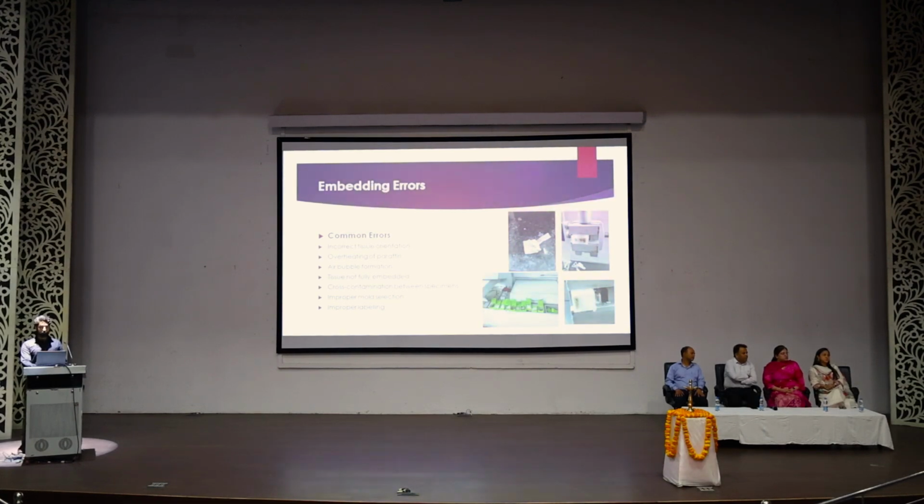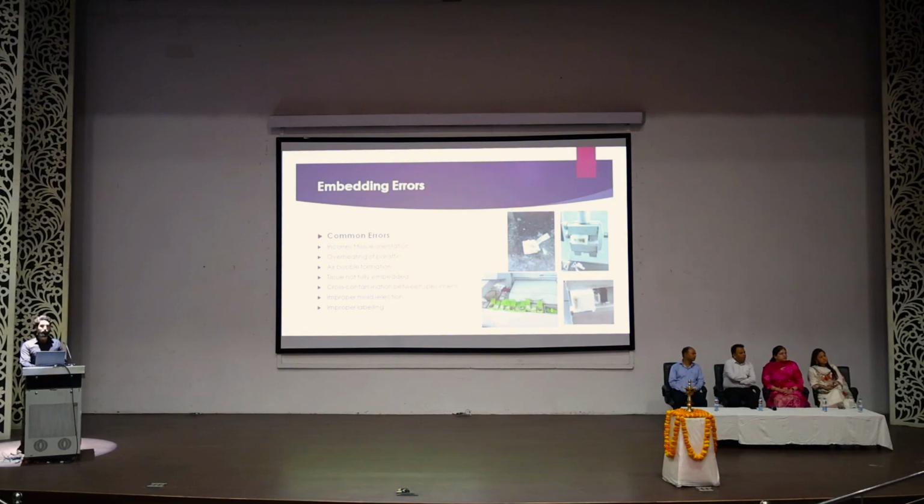When a technician casts the blocks at a time, for any reason he may forget which tissue from which cassette he has embedded in which mold. There is a possibility he may take one label from one cassette and label it to another block.